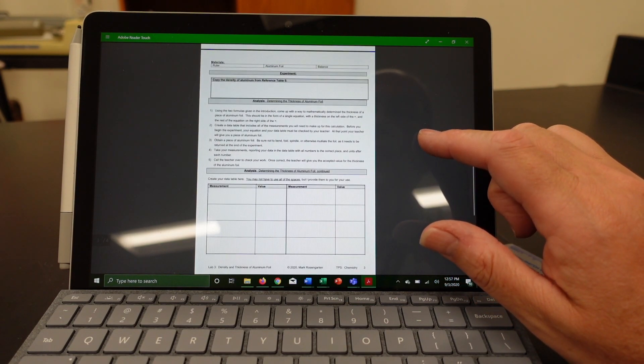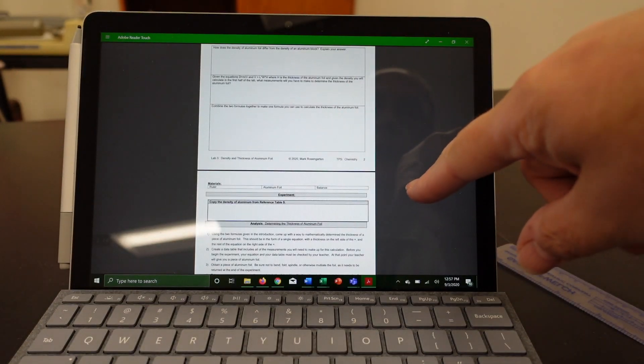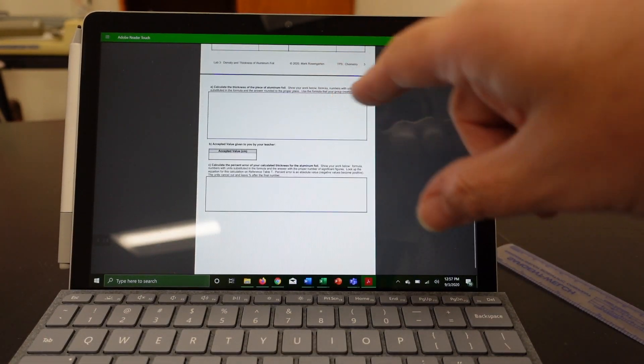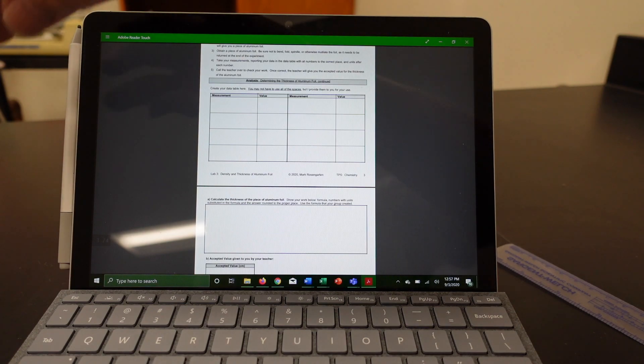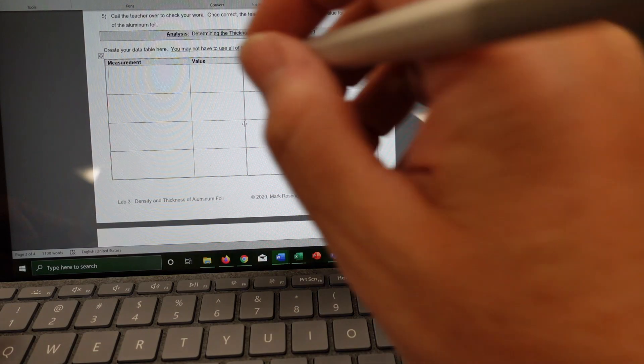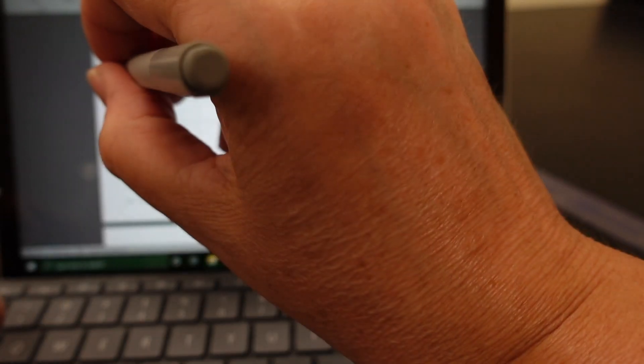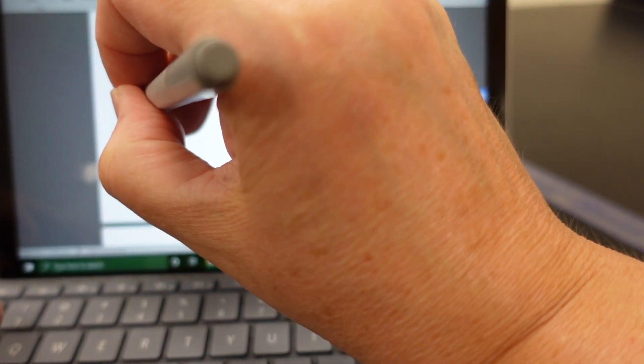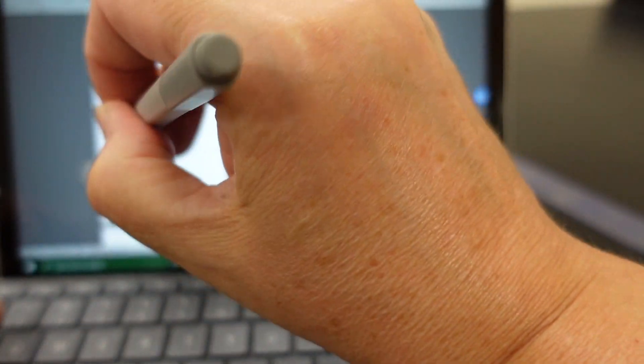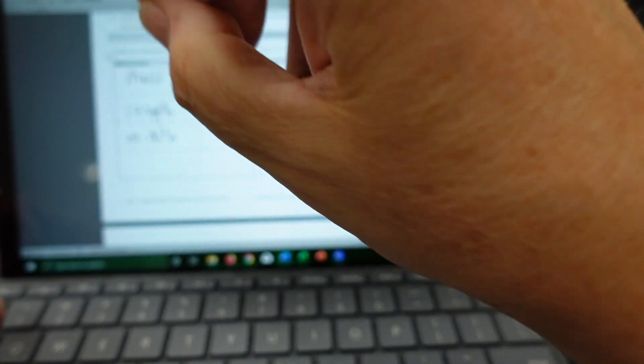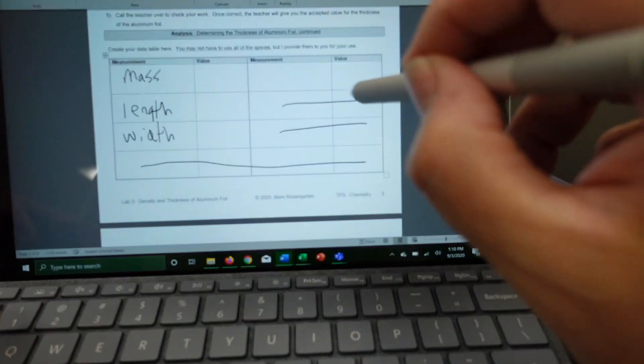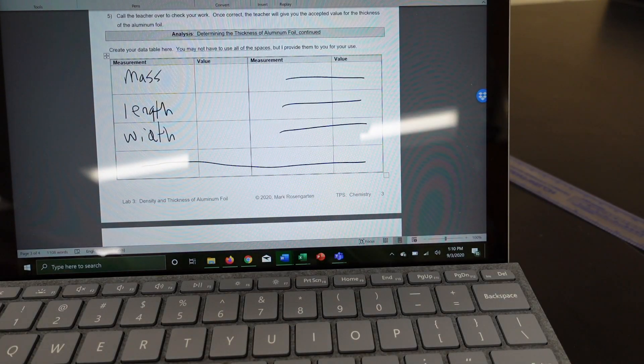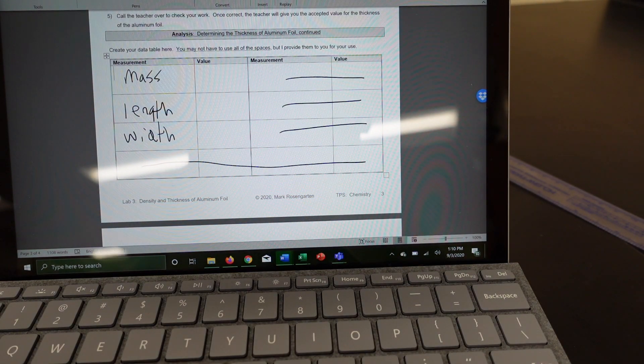And then after we're done, you're going to use your combined formula to find the thickness of aluminum foil based on the calculations that you've come up with. So at this point, you know that you're going to need to measure the mass of the aluminum foil, the length of the aluminum foil, and the width of the aluminum foil, which means you don't need to use any of these other spaces. All we need are those three. So let's go ahead and measure them now.